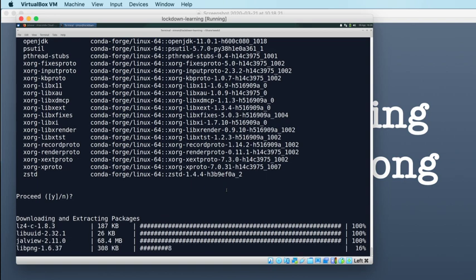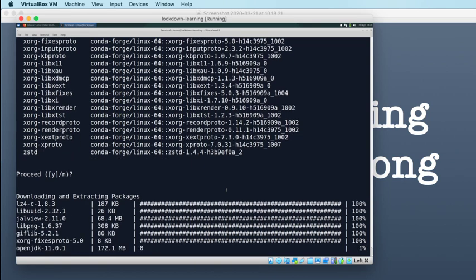And so I think it might be relying on your path to be right, and it's not really. Sorry, I'm thinking aloud. So it might be that conda activate MSA within the script doesn't work at all for various reasons.